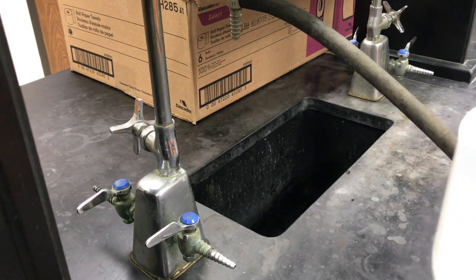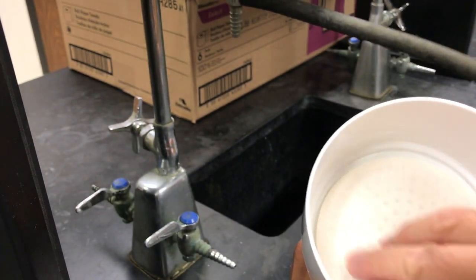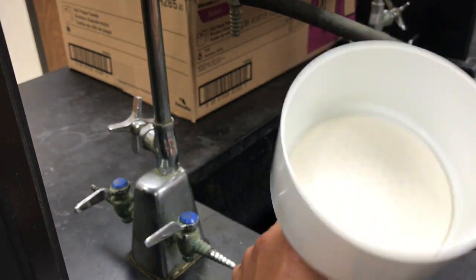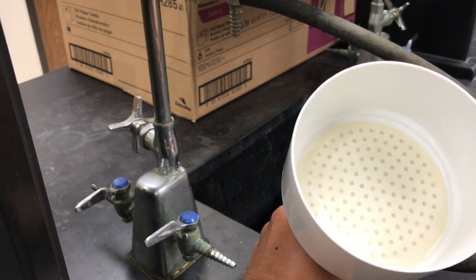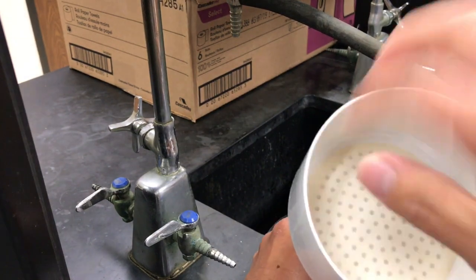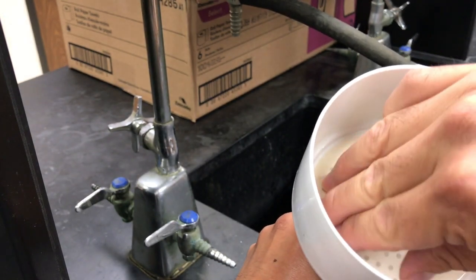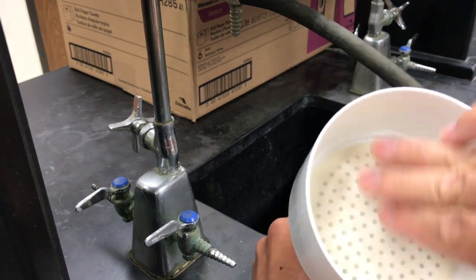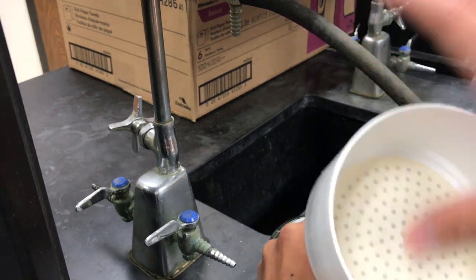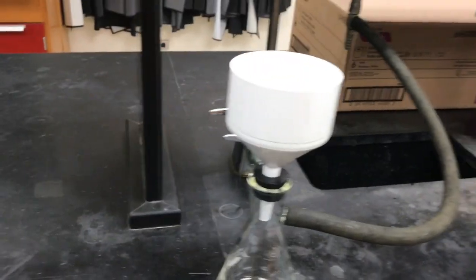Now, before we start, the filter paper, we need to make sure that it's pressed flush against the bottom of the funnel. So I'm going to use some deionized water, get it wet, and press down the edges and make sure that we have a seal, because we don't want any solid chunks getting underneath the paper, because then they'll flow out and then we won't be able to trap them. So that's pretty good there. And so when I turn the water faucet on, it's going to create a suction.